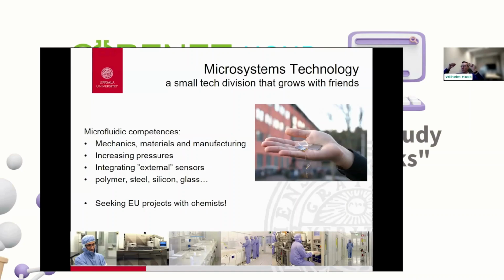If it is white, it goes down, etc., etc. So you essentially digitize the information from the pixels in your picture into changes in input conditions of your chemical reservoir. So that's also why you would say that's a bit slow, right? Because it means that pixel after pixel have to work through a change in input conditions, which would then take a certain amount of time to reach a steady state, and then you measure it.